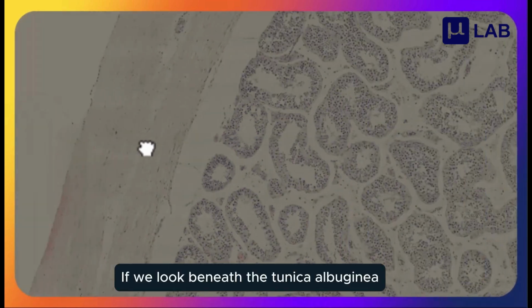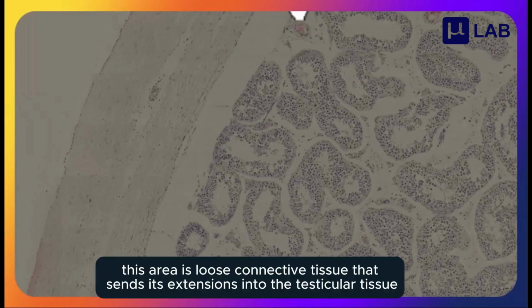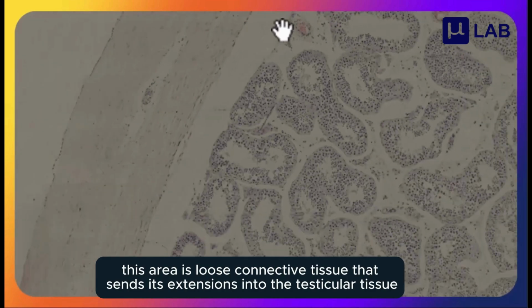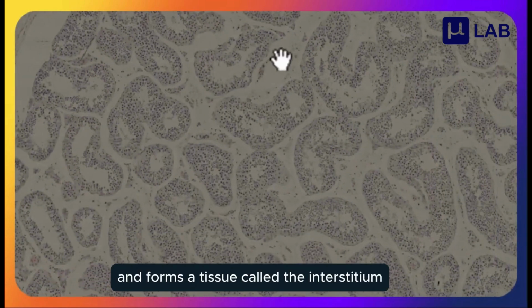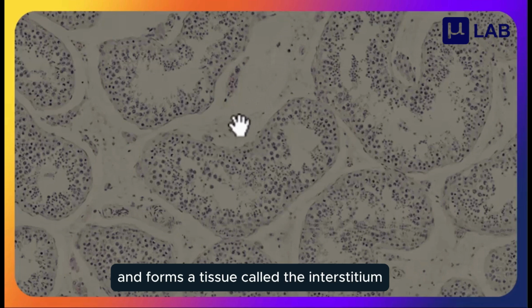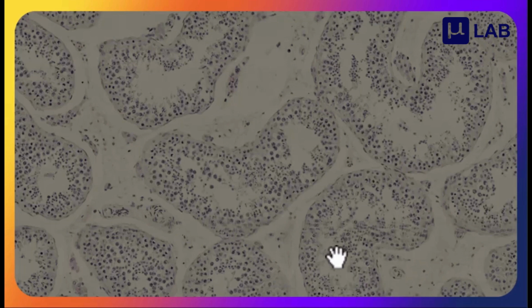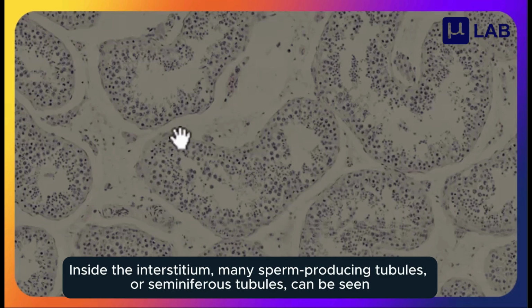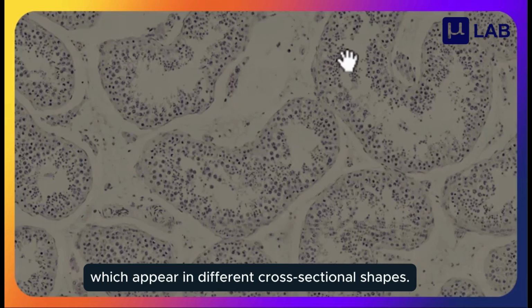If we look beneath the tunica albuginea, this area is loose connective tissue that sends its extensions into the testicular tissue and forms a tissue called the interstitium. The areas I am showing you here are the interstitial tissue. Inside the interstitium, many sperm-producing tubules or seminiferous tubules can be seen, which appear in different cross-sectional shapes.